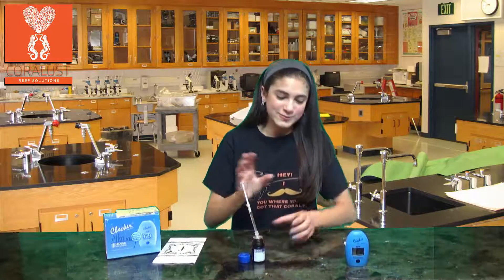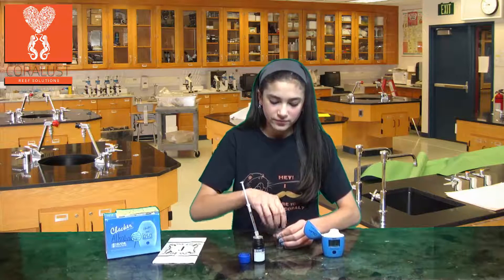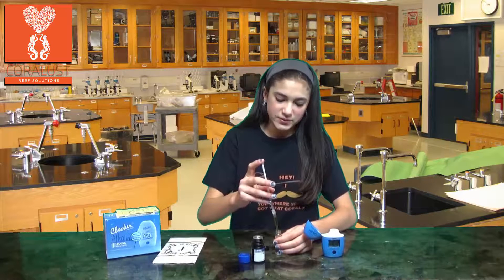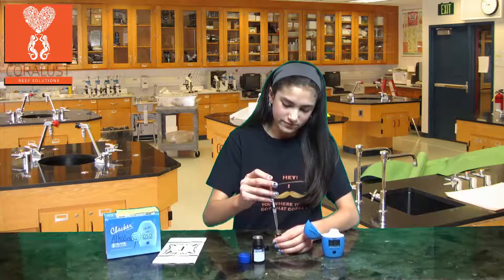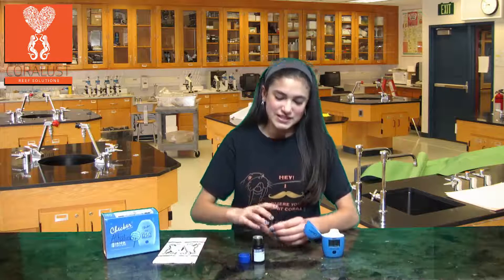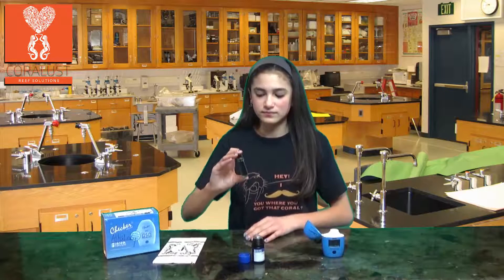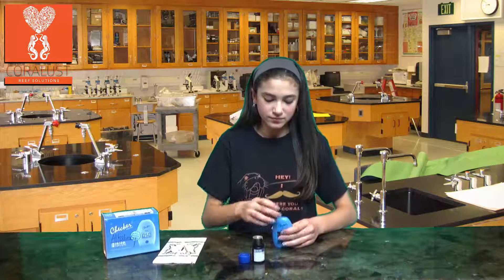Now take the vial out and mix it with your reagent. Mix it gently and invert it five times. Now you're ready to put it in — press the button and wait for your results.